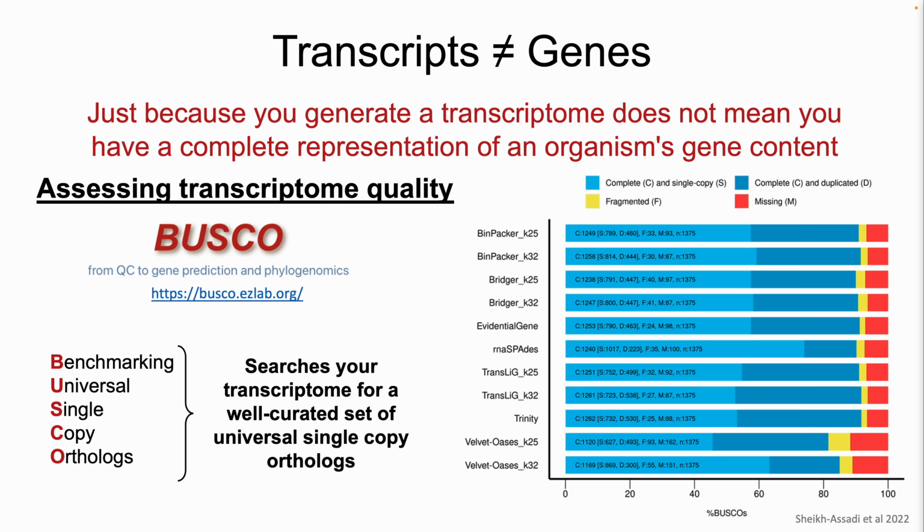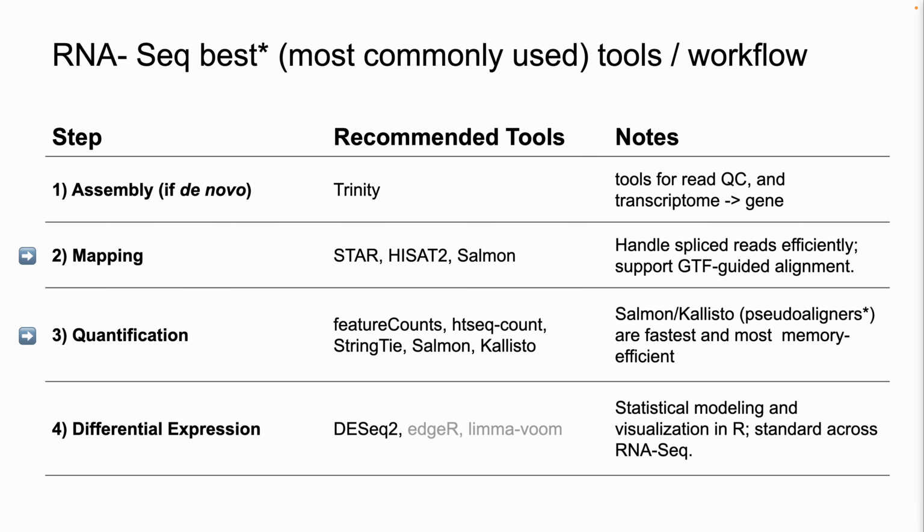So that's what you kind of have to do if you get messy transcriptomes. But ideally, if you've got 95-ish%, which, if you've sampled well, enough developmental or enough tissue time points, it's totally common to see 90+% of transcripts in a BUSCO analysis. Okay, that's assembly and Trinity. That was a long time on an approach that we're not really going to use. But hopefully somebody, and I know lots of labs in the department are doing it.